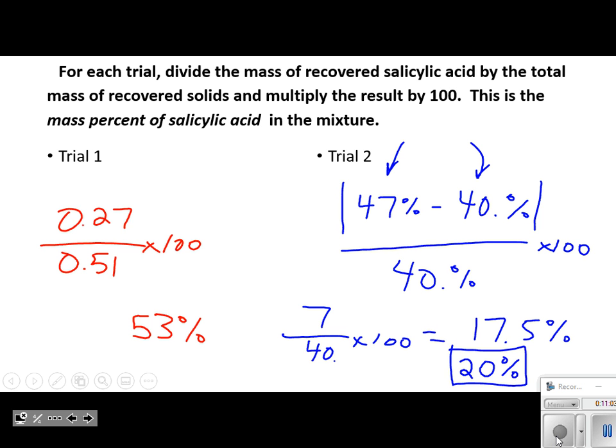If I have M&Ms, and I have 40% red and the other 60% green, does that mean if I scoop out M&Ms, I'm always going to get those percentages? You're not always going to do that, all right? So that's why it was probably a little bit off, that 20% error that I just calculated, because my scoop could have had a lot more charcoal in that particular confined area, okay?